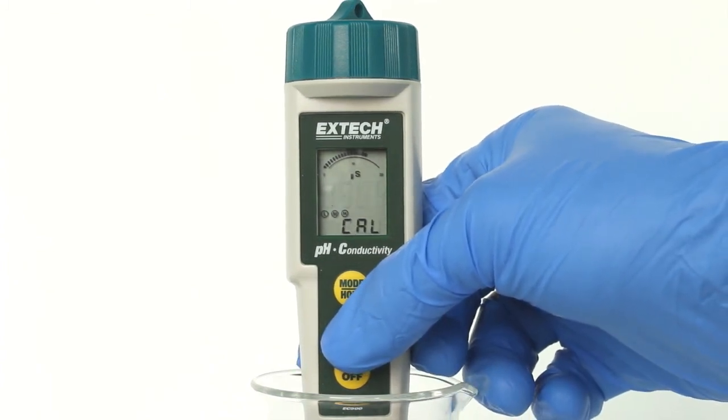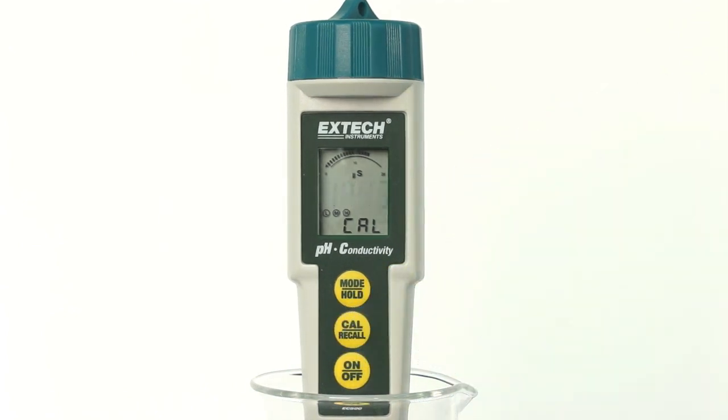Press and hold the CAL button until CAL appears in the lower display. The main display will start flashing. The meter will automatically recognize and calibrate to the standardizing solution. The display will briefly indicate SA, then END, and return to the measurement mode after calibration. The SA will not appear if the calibration fails. The range calibrated symbol will appear in the display for each range that is calibrated during that power-on cycle.